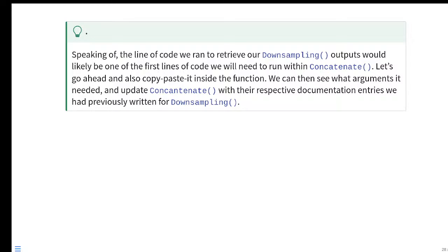You would need to probably tinker with the column names to make sure the parameter for one channel on one instrument matches the parameter of the channel for the other one. So a little bit more complicated across the board.